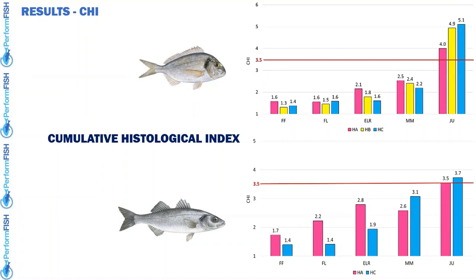For example, we assume that in some hatcheries, I think in two of the three hatcheries that we have the samples from, they use a RAS, the recirculation system, for rearing larvae and juveniles, and then you will see some pictures that demonstrate this.